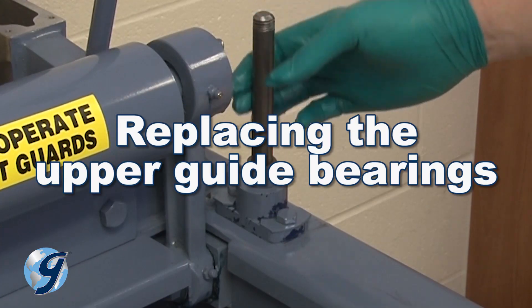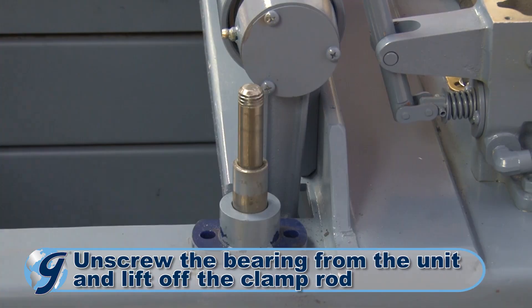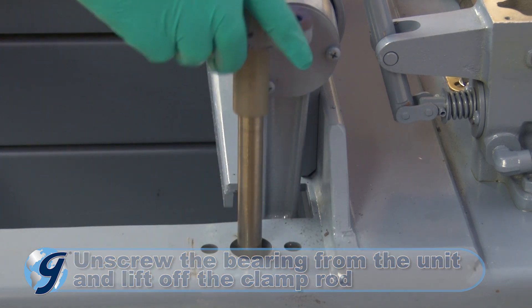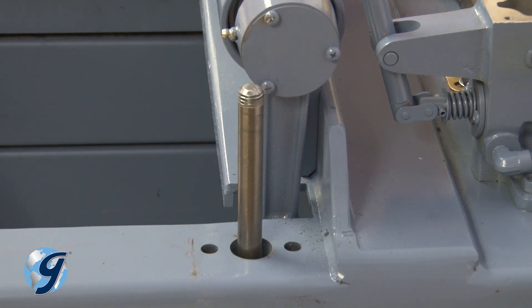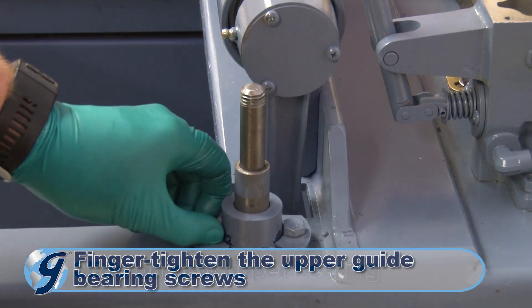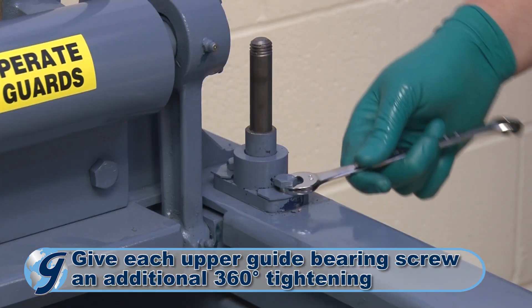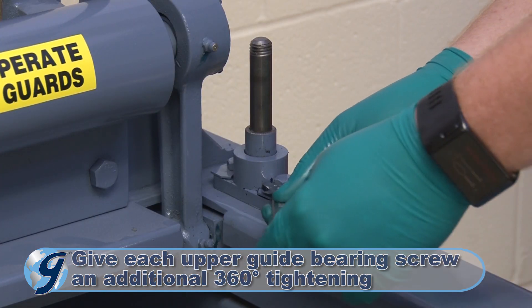To replace the upper guide bearing, unscrew the bearing from the unit and lift off the clamp rod. Slide on the new bearing in the reversed manner. Now, finger tighten the upper guide bearing screws. Then give each screw an additional 360-degree tightening with a wrench.